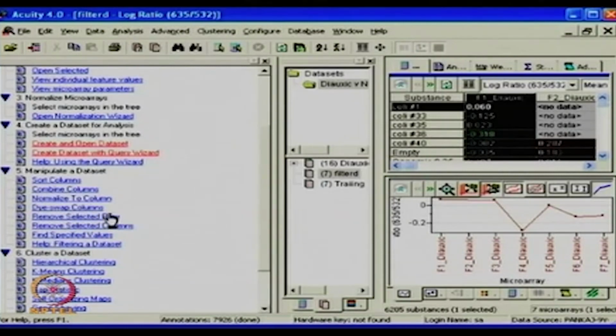We also talked about dye swap, and I was talking to them about dye technology and how one needs to use, in fact, labeling with different dyes and reverse dye swapping so that there is no dye bias in the analysis. True. So the same can be accommodated here in the microarray to look at. That was a very nice part actually to go ahead with.